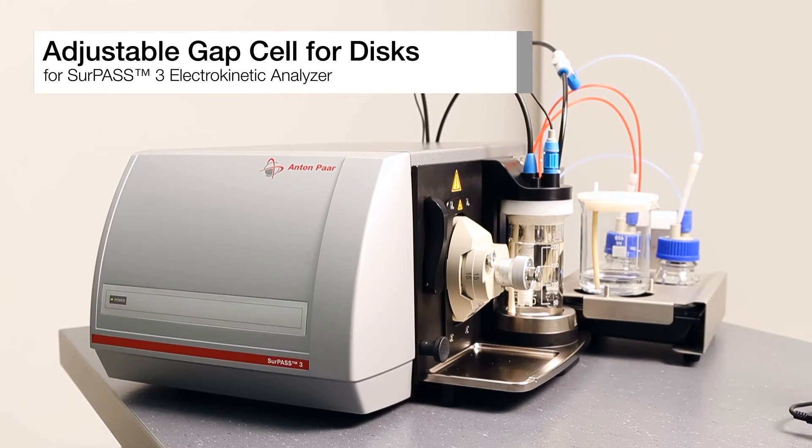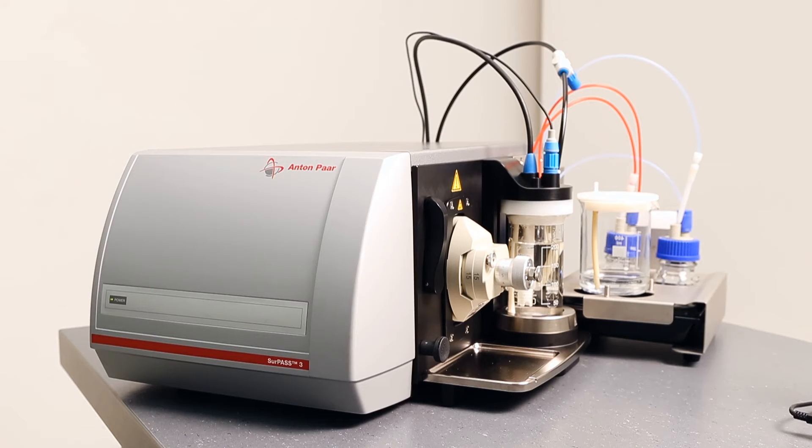This is the adjustable gap cell for discs for the Surpass III electrokinetic analyzer. It's a measuring cell for flexible or rigid planar samples that are available as discs with a certain diameter.